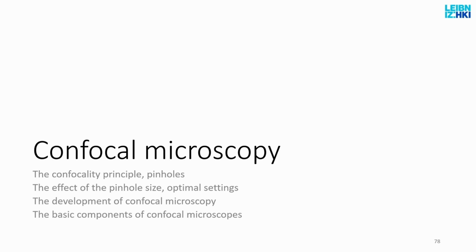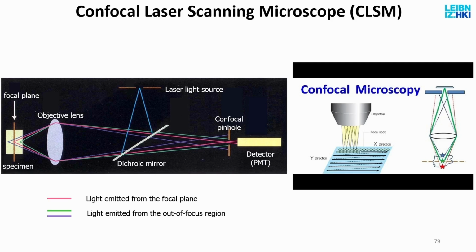But can I do this optically? Can I do an optical slice? Yes, we can, and this is called confocal microscopy. And here's the principle. It's very, very simple.